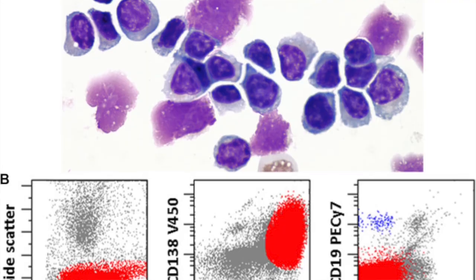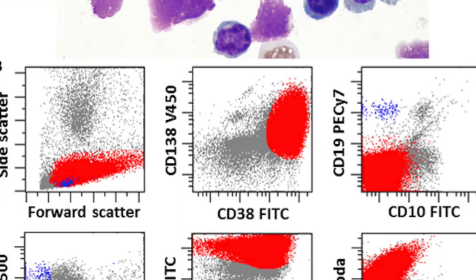We can also identify multiple myeloma using this technique, for example, detecting abnormal plasma cells and monitoring response to treatment. We can also identify surface markers like CD38, CD138, and CD56 for this myeloma diagnosis.